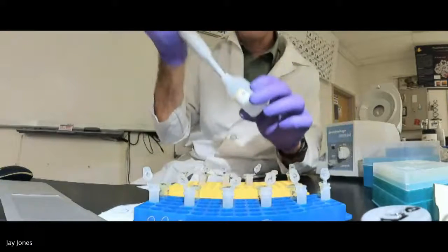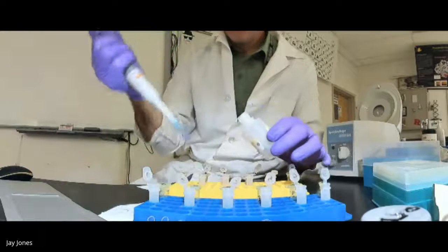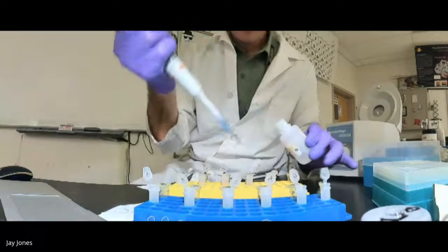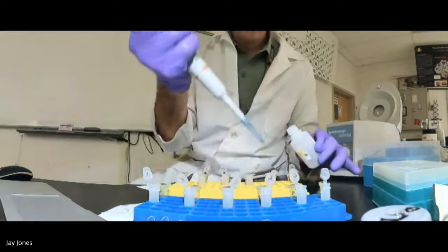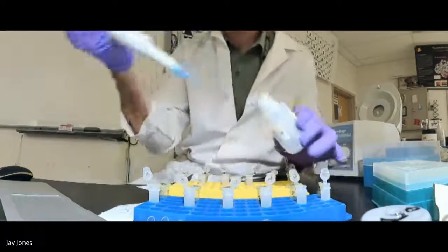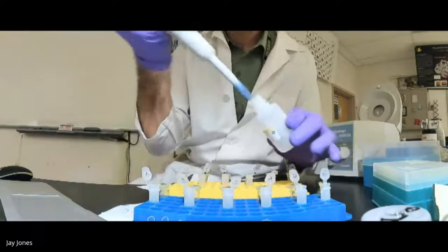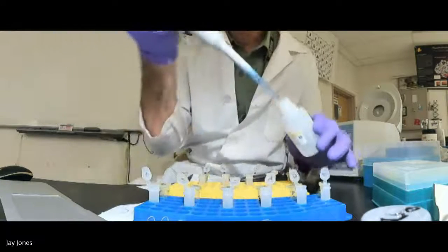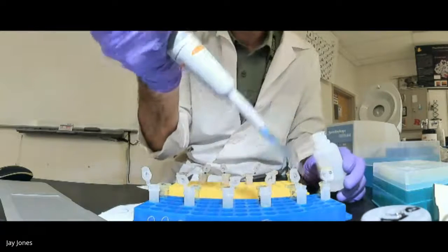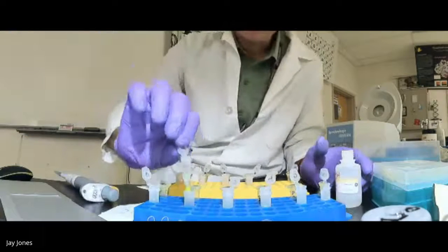I'll start with the back, table 12. Here we go. T1, T2, T3, T4, T5, T6, and I'm really watching the wash buffer go in. T2, T3, T4, T5, T6. I gotta check this table.